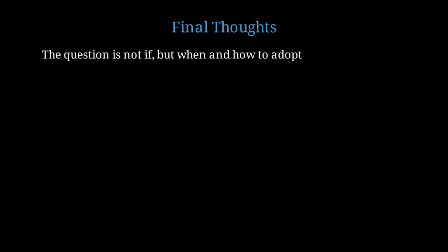It's a transformative technology that's already delivering real results in drug discovery, diagnostics, and fundamental research. For researchers in this field, the question is not if you should adopt AI tools, but when and how. Starting with small pilot projects is a low-risk way to gain experience. Remember that AI is a tool that augments human creativity and intuition. It handles tedious optimization and data analysis, freeing researchers to focus on hypothesis generation and experimental design.